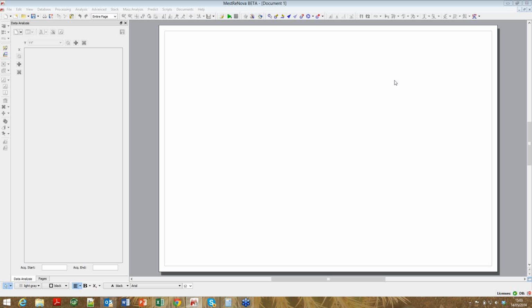We had some questions last week about how to use the initialization of the concentrations and so forth, and I did write a little blog article on that, which you'll find on the Mestrelab website. If you can't find it, let me know. There's also a link to it on LinkedIn, and I'll try to touch on some of those points today so that you can see them in action a little bit.